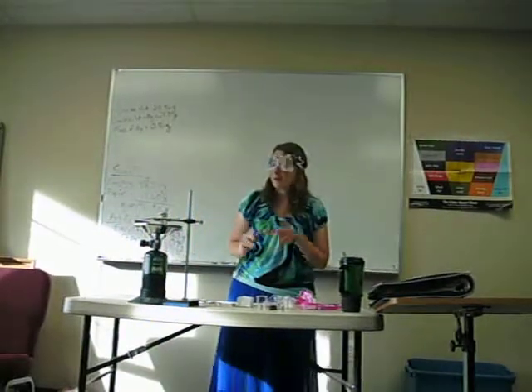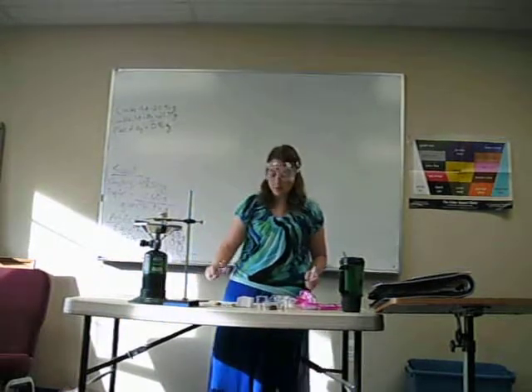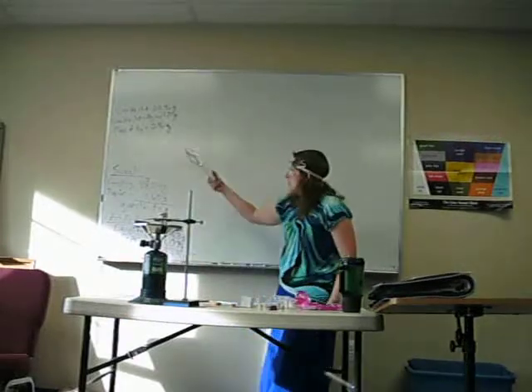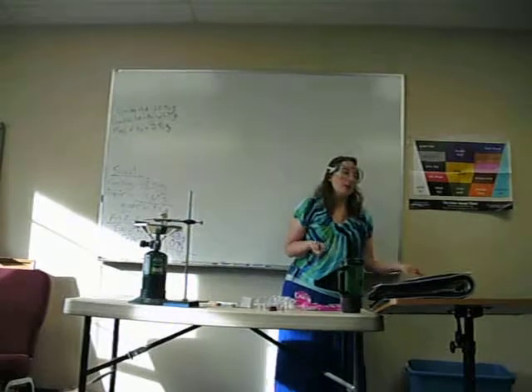So what's happening in there is our metal is going to react with the oxygen in the air and form a new compound, this powdery white stuff, magnesium oxide. We know how much the magnesium weighed before. Will you expect the product to weigh more or less?